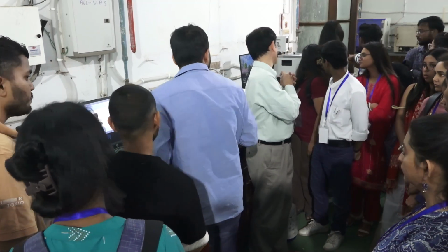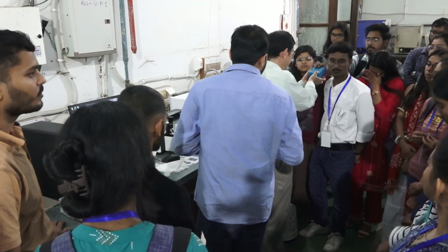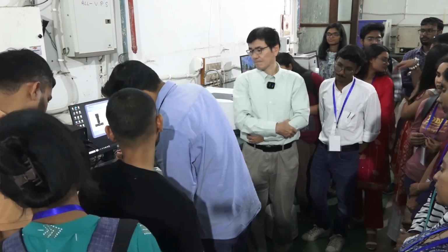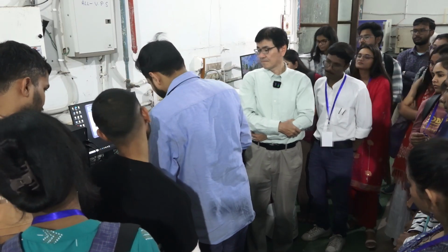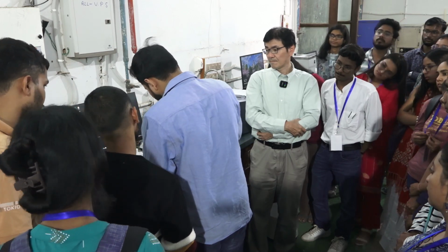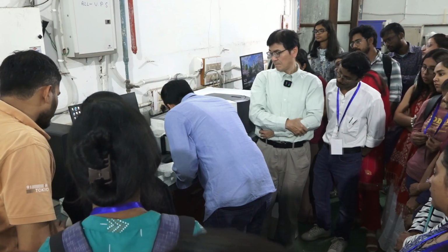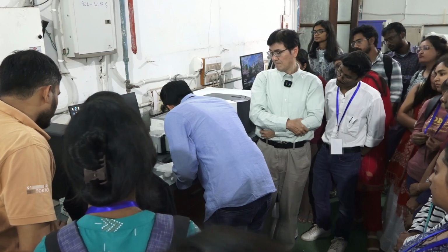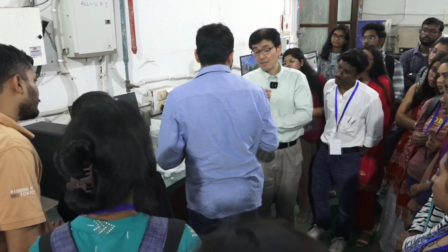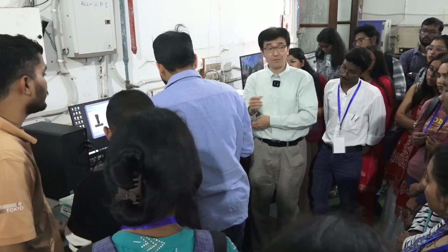Is there a box? Tip box. How much sample did you put? One drop. 10 microliter or so. Very small amount. 10 microliter is sufficient for one measurement.